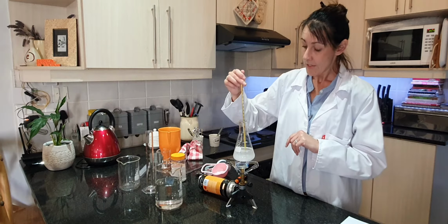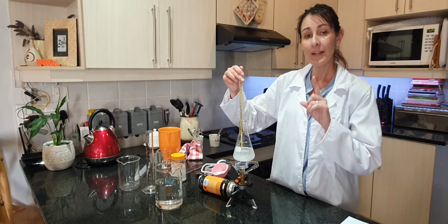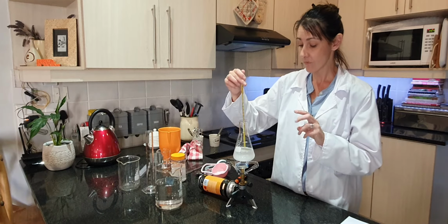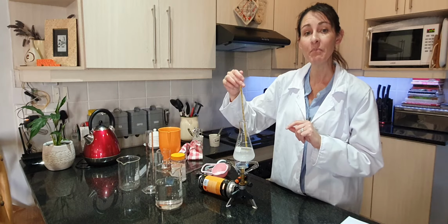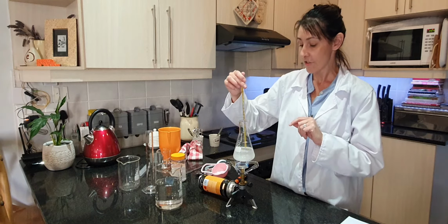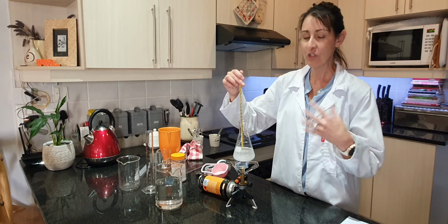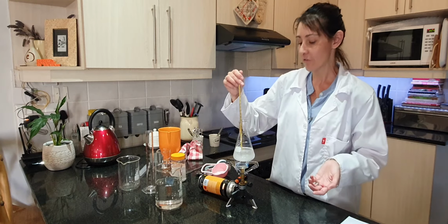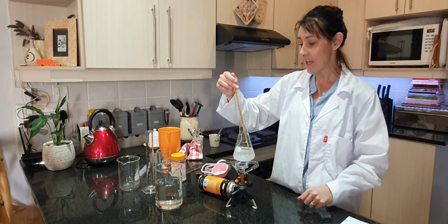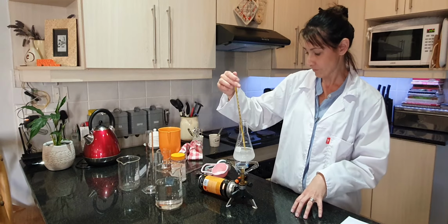Okay, so in this experiment, there's one thing that we are keeping constant, and that is the 150 mils of water. So we aren't using any other amounts of water. We don't use 150 now, and for the next one 200, and for another one 50. No, we keep it the same amount. So we call that our constant variable.